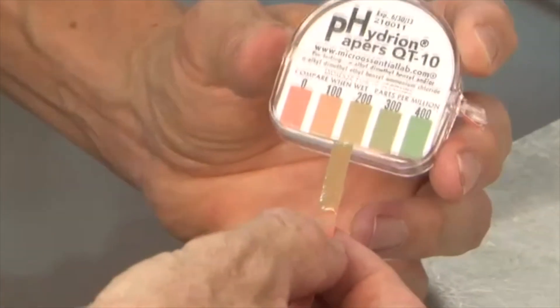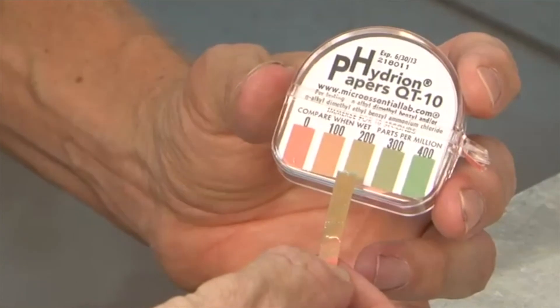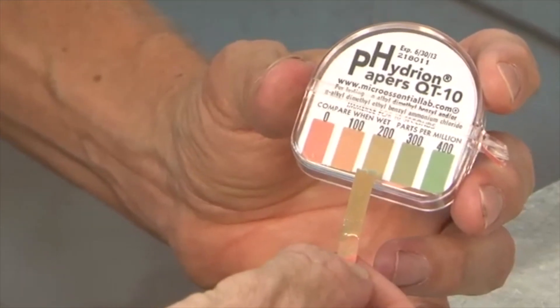Remove the test strip and compare the color of the paper with the kit's color chart, which shows the quat concentration in parts per million, ppm.